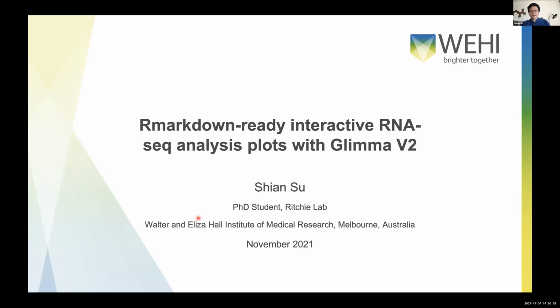Thank you, Kozo, and thanks to the Bioconductor Asia Committee for allowing me to give this talk. So today I'll be speaking to you about Glimma version 2, which is an update to our Glimma package that's been in Bioconductor for more than 5 years now. And the main feature of Glimma version 2 is to introduce Markdown integration to the existing plots that we have. And also it includes quite a few major updates in order to make that possible.